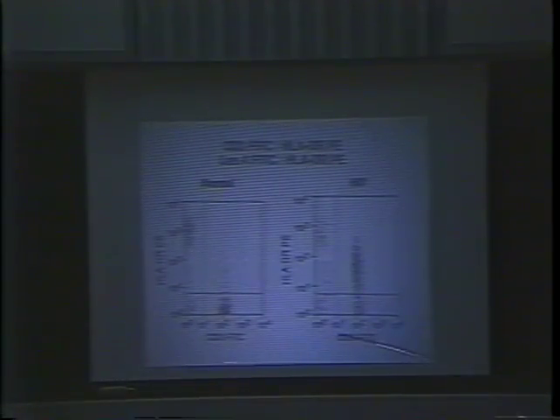They're present, but not in great number. If we now turn to an individual infected with human immunodeficiency virus, we see a decrease in the number of B cells, some activated non-B cells, and a large increase in the activated T cell population. This slide represents how the flow cytometer can take a single marker, which can be both an activation marker and a cell identification marker, and show how it is an appropriate way of studying a disease state.